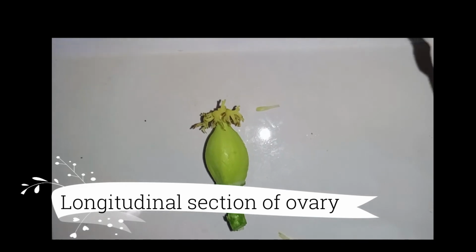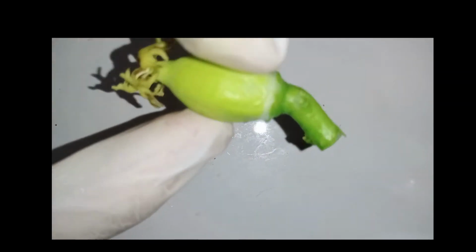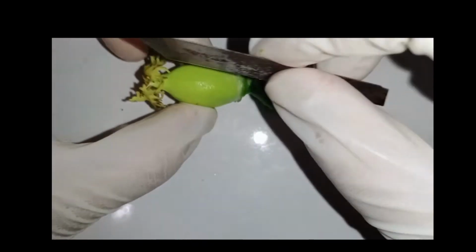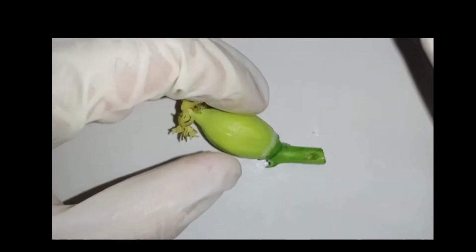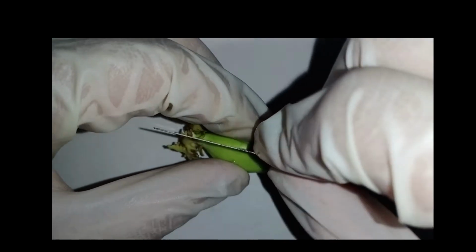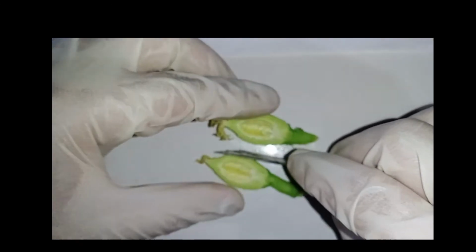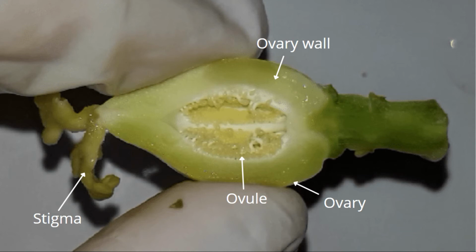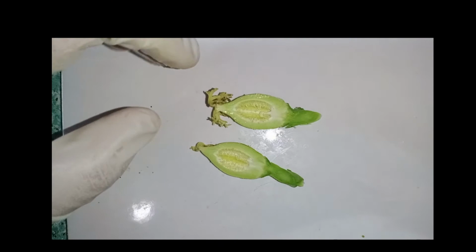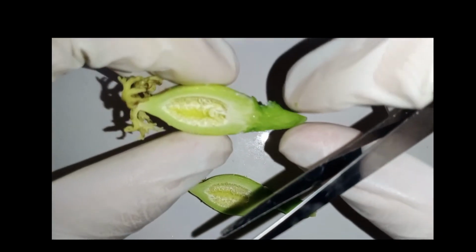Now we will do a section of the female flower to see the ovule. We will do a longitudinal section, cutting at the center of the ovary. So we have two parts of the female flower.